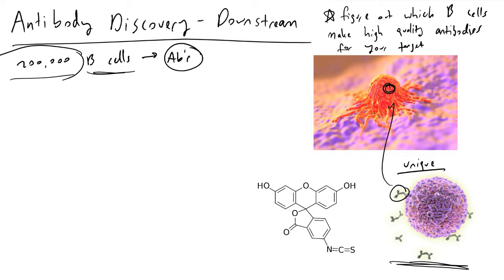Generally, what scientists do in research labs today is they have characterized the surface receptors on tumors very well, and so they can make use of bead-based assays in order to bind to this cancer. Now, I'm going to discuss a slightly different variation to this, and I'm going to try to keep this high level without getting too deep into this, and stick to a constant story here, so that I have a video that makes somewhat sense to me.